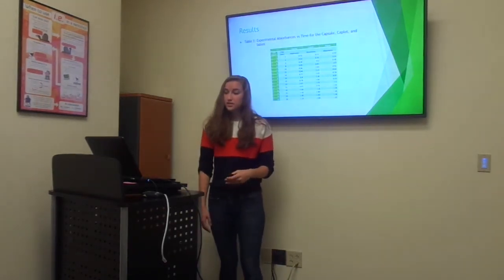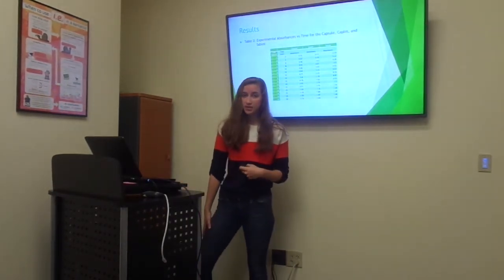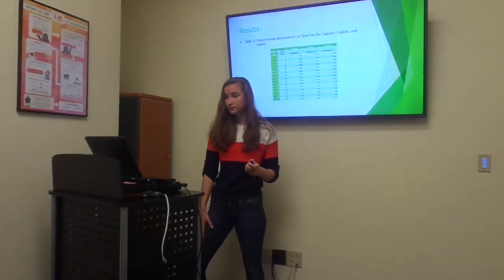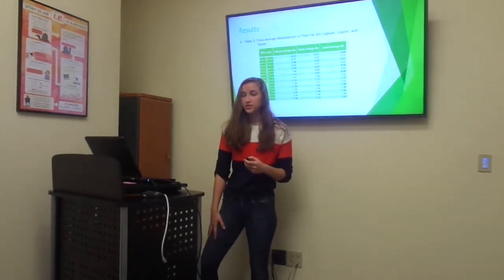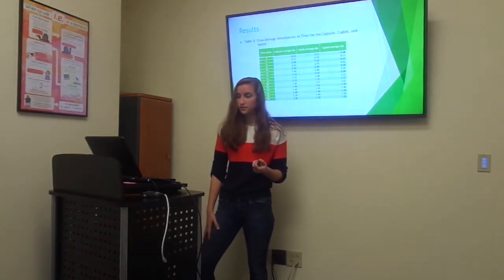Table 2 shows you the data for the capsule, caplet, and tablet at the 2-minute intervals for the absorbances of each solution. And that was then compared to the class average of each of those 3 samples.